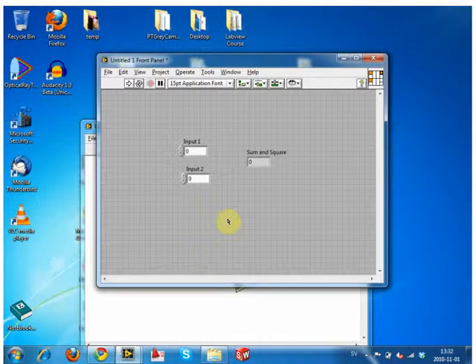So you just left click on the box. Then the whole thing's kind of glowy, and then we just hold it and drag. So the question is how you move these things around. You click somewhere in it until you get this dotted line all around it, and then left click and drag, and you can just move it wherever you want it.